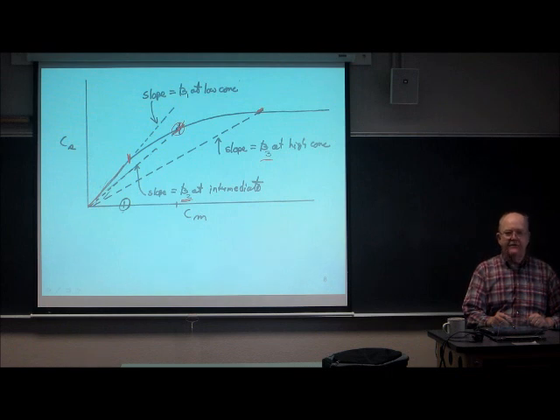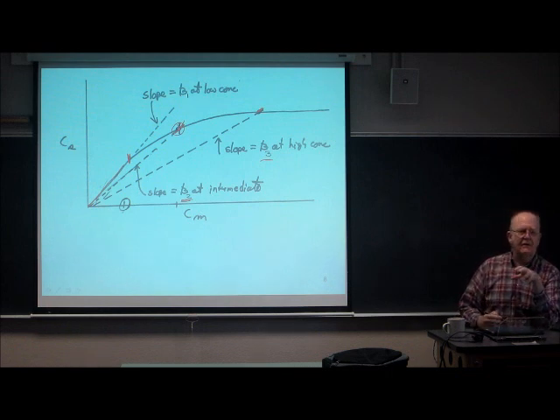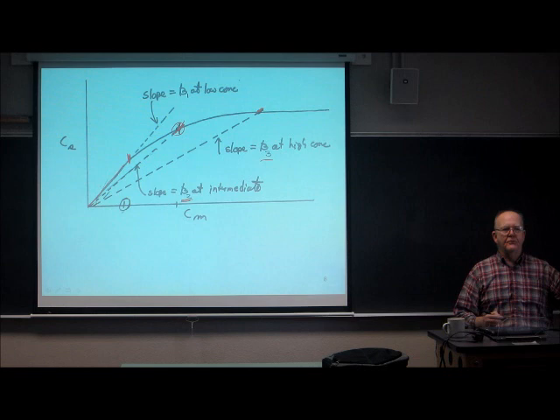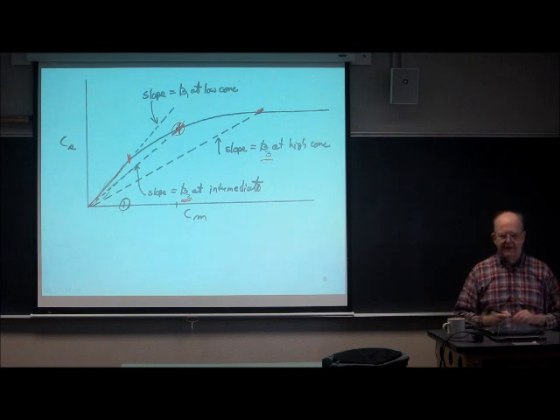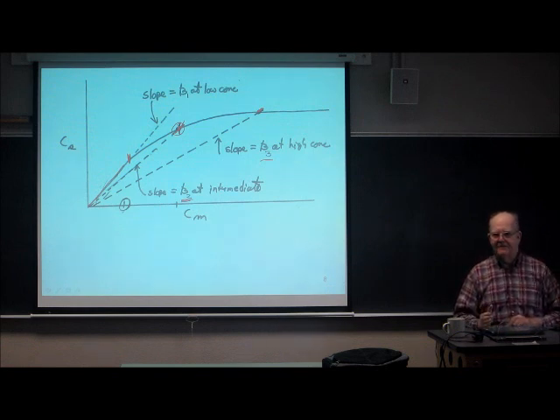But some of the molecules here have to behave as if beta is smaller. Now if beta is smaller, the K factor is smaller, and some of those molecules are moving faster than the other molecules which are in a more dilute region of the column. So what I'm telling you is that the velocity of the molecules depends upon what concentration they're at.